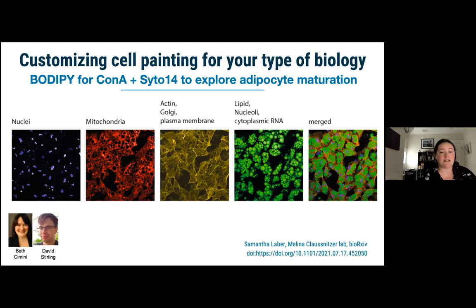One is just, as I said before, the magic in this technique is in the lots and lots of measurements. It's not in anything to do with the particular dyes that we're using. And so we're starting to work with some groups to create customized dye panels for particular biology, in this case, lipid biology and adipocyte maturation biology, and take this same morphological profiling approach, but in new stain panels.